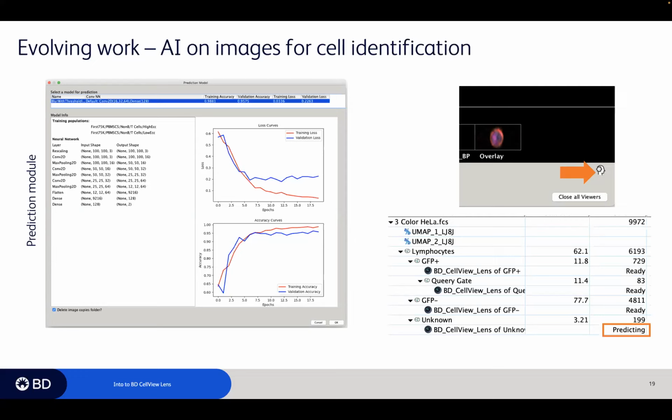So this is just showing that with a little bit of configuration, you would see this gearhead icon pop up in the bottom right-hand corner. If you're interested in doing this and currently on a Mac, contact me, and I can give you instructions on how to make that hidden preference appear. Again, still working on this one.